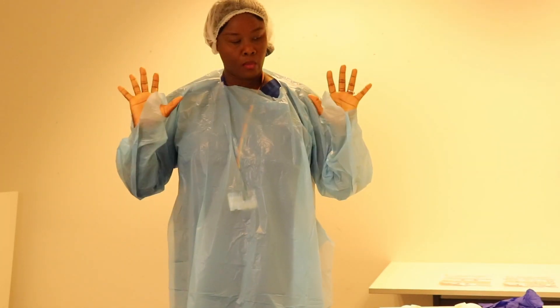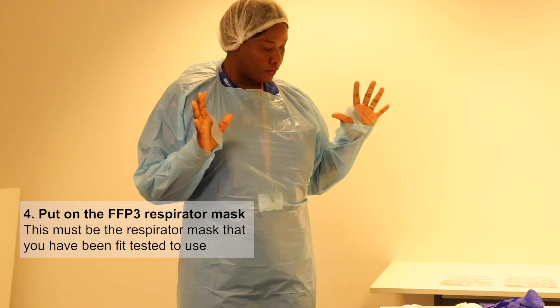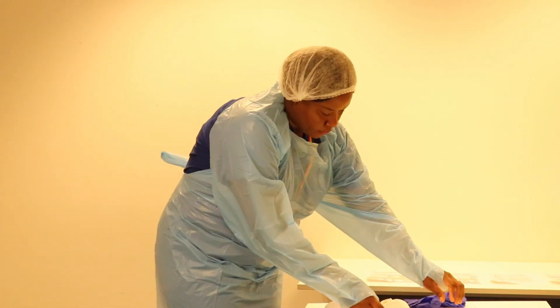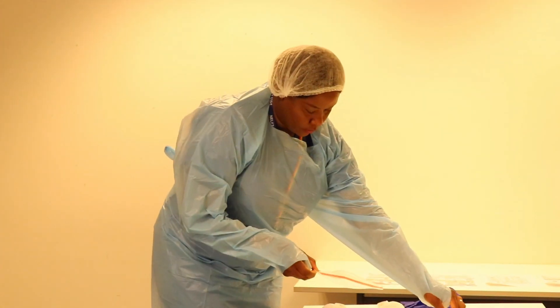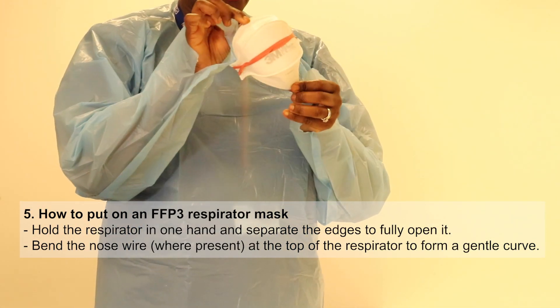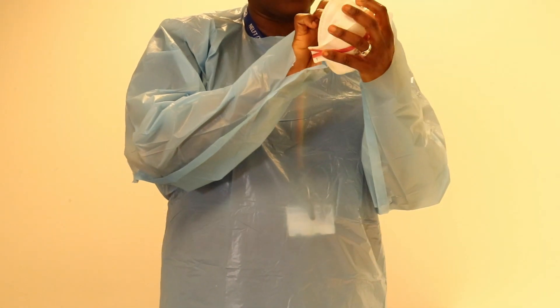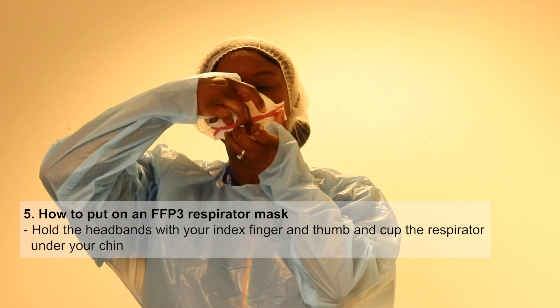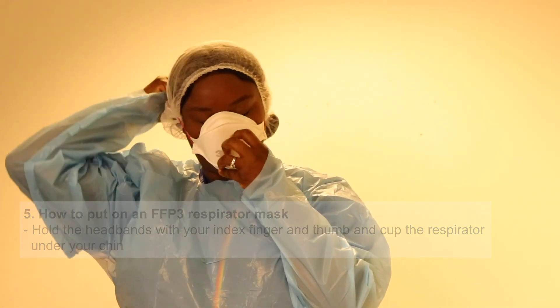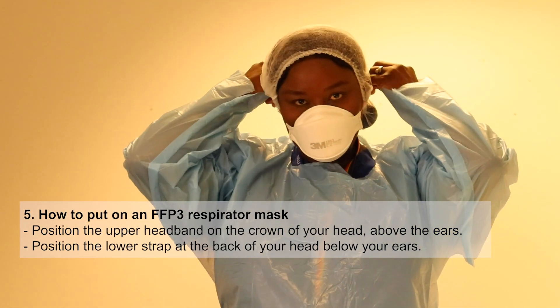We do have donning and doffing rooms on the wards. Next you would put on your FFP3 mask — you would only wear the one that you have been trained on. This is a 3M one. You open the flaps up, cup it in your hand, pop it over your face, and then pull the ties around the back. One of them should be above the ear and the other one below for it to fit properly.